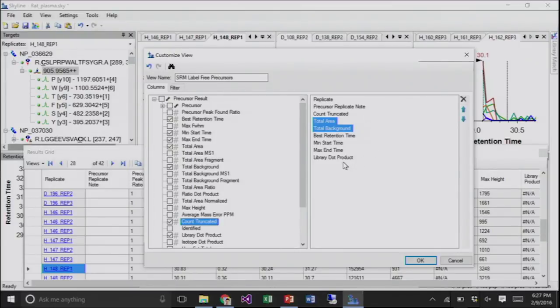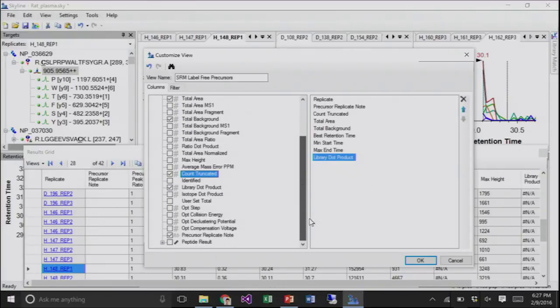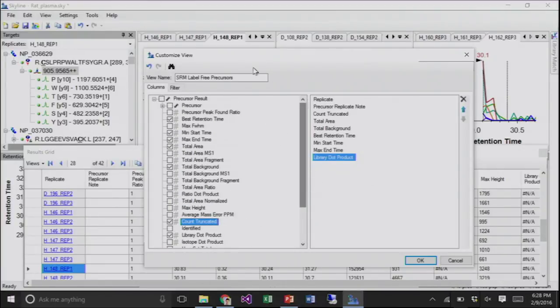Is anybody still with me? Okay, if you're not with me, this is not super critical. You could have gotten totally lost, and we're going to move on, and you won't be like, oh, I fell behind. This is just kind of fun to start playing with these grid views, which give us immediate numerical information, extremely useful information, and it's very customizable. So when we decide this is the most useful way to look at this, you can do it.